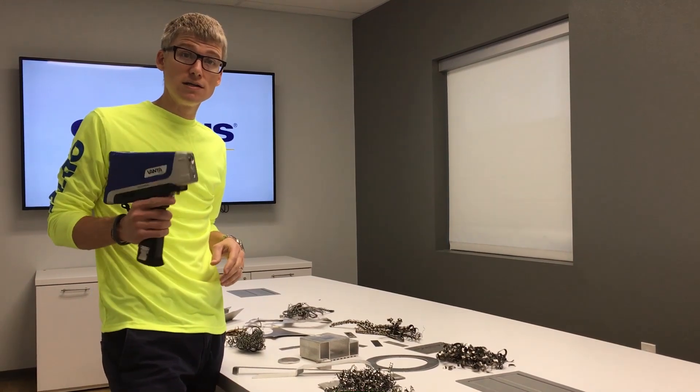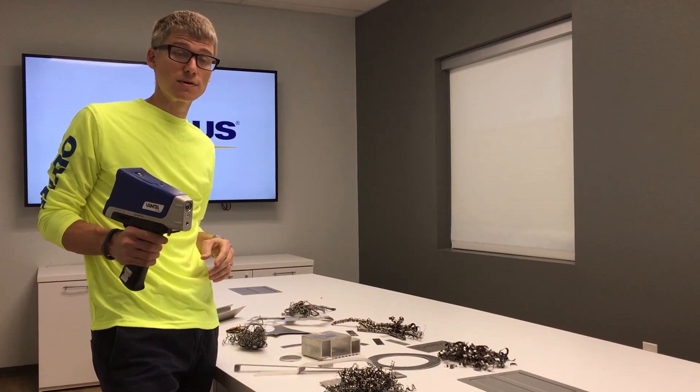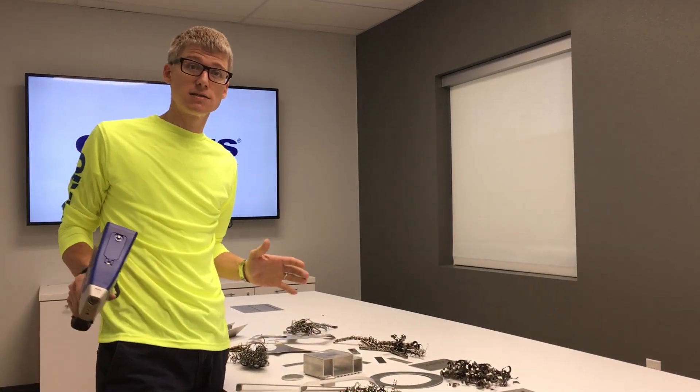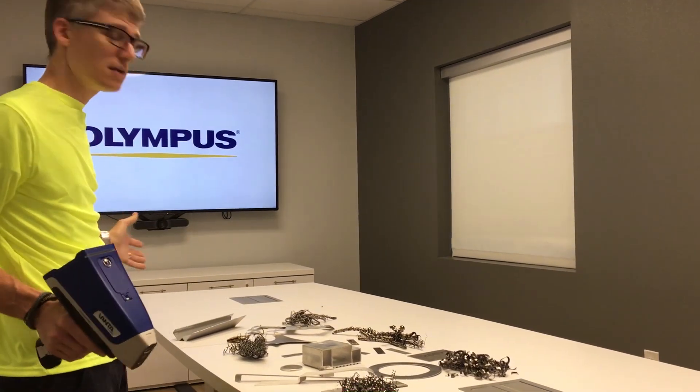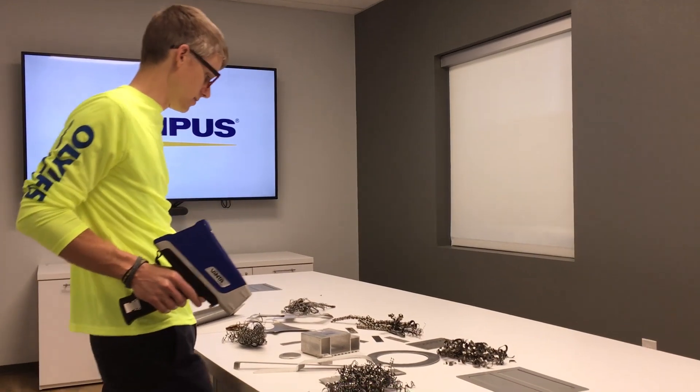The Vanta XRF is a rugged, industrialized instrument to help you make money in the business of scrap sorting. There's always a lot of hype about XRF instruments and scrap sorting. Let's not complicate this — let's just show how easy it is. Got some samples. Anybody can hit samples in the lab, but let's hit the samples that our customers give us here and show how it's done.